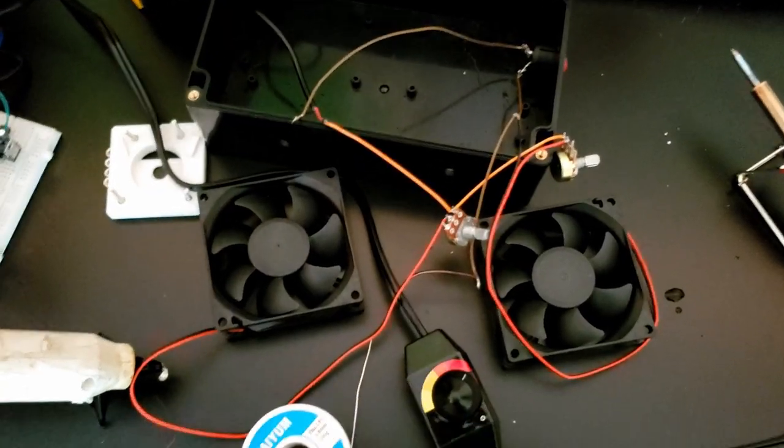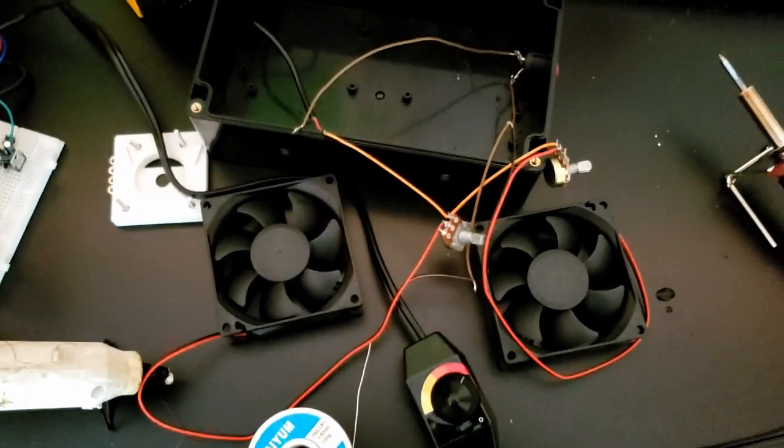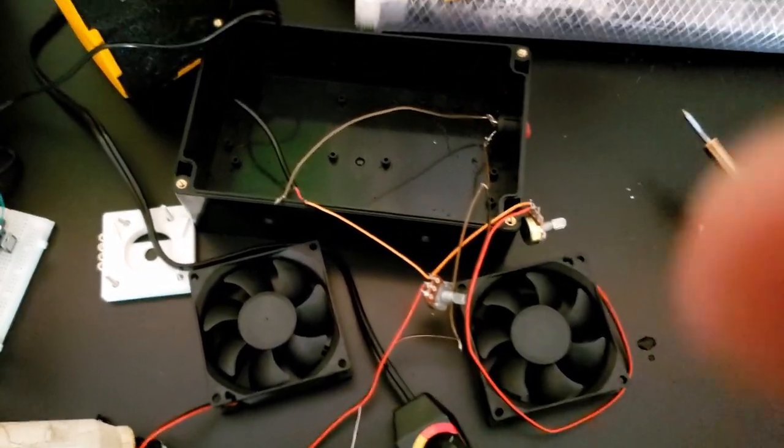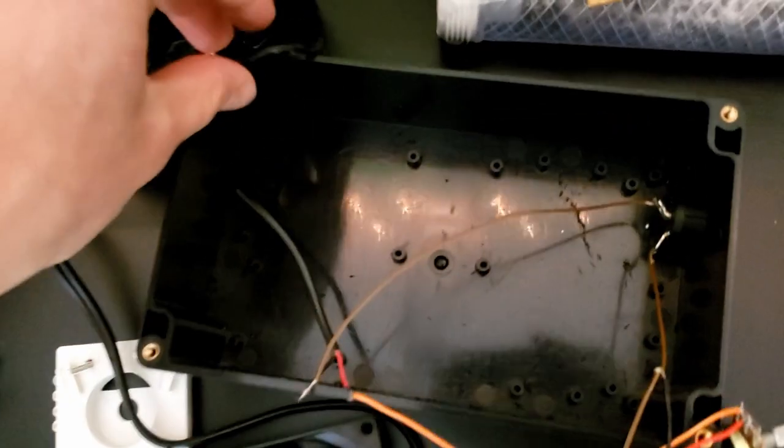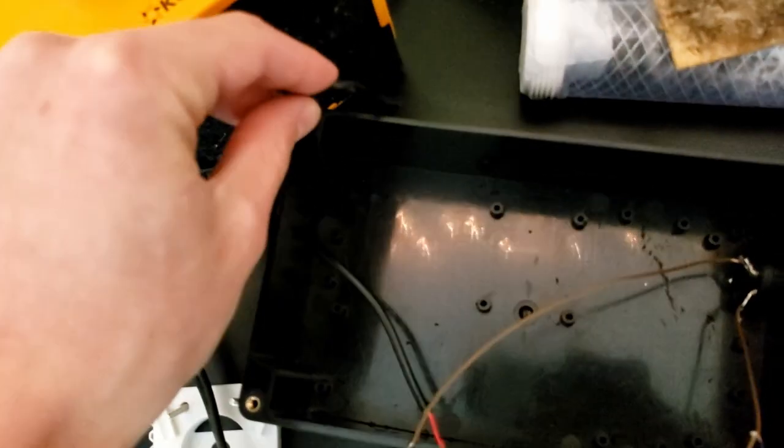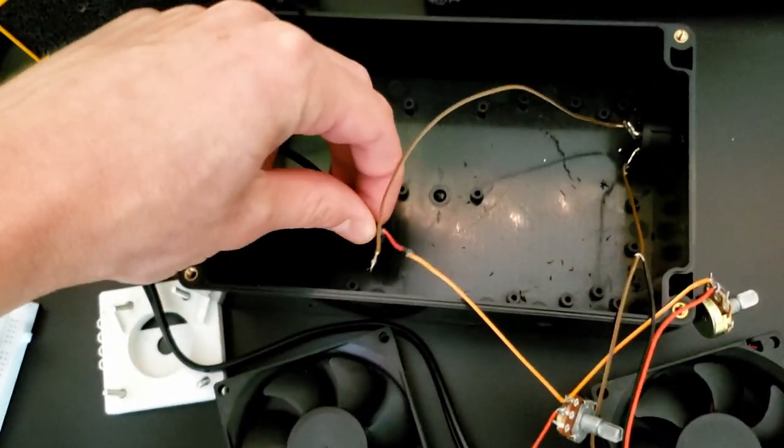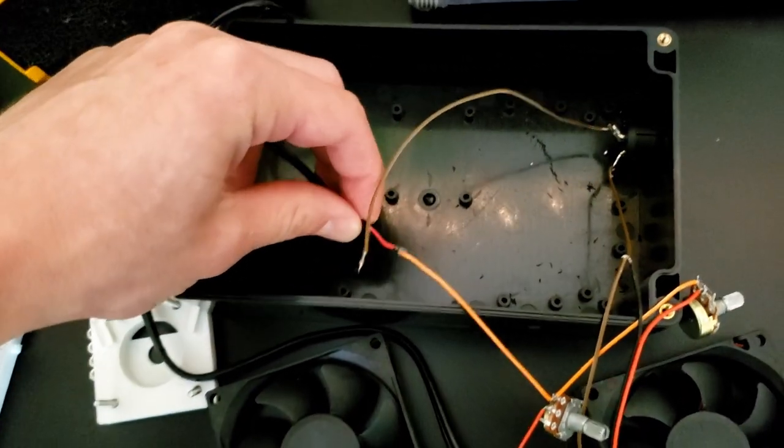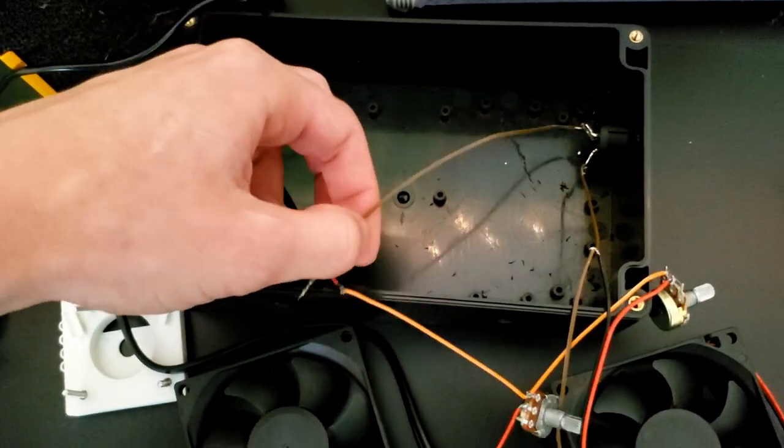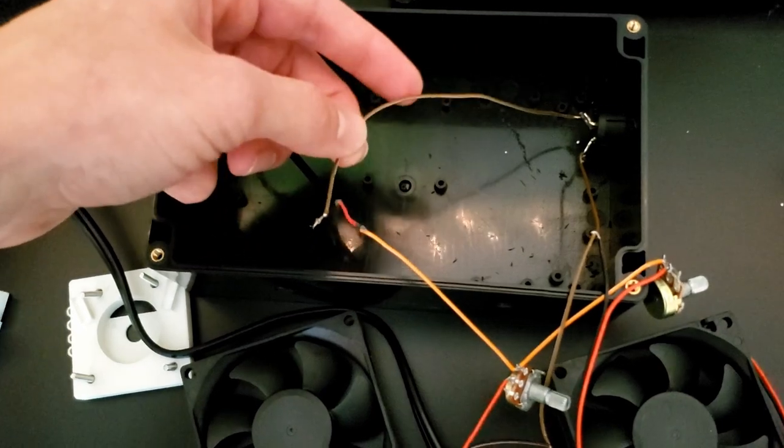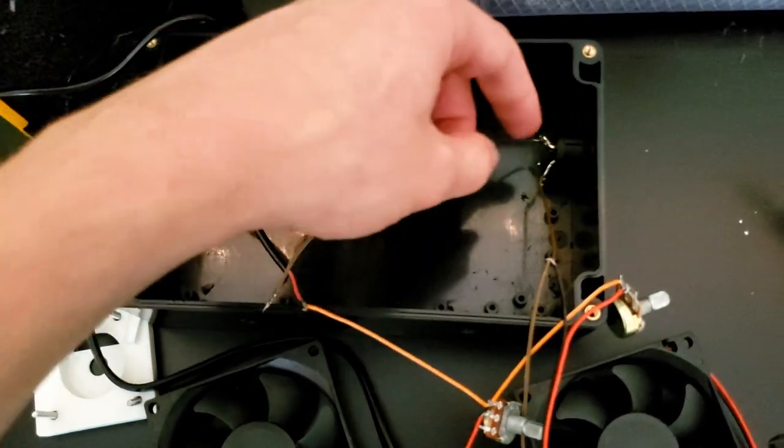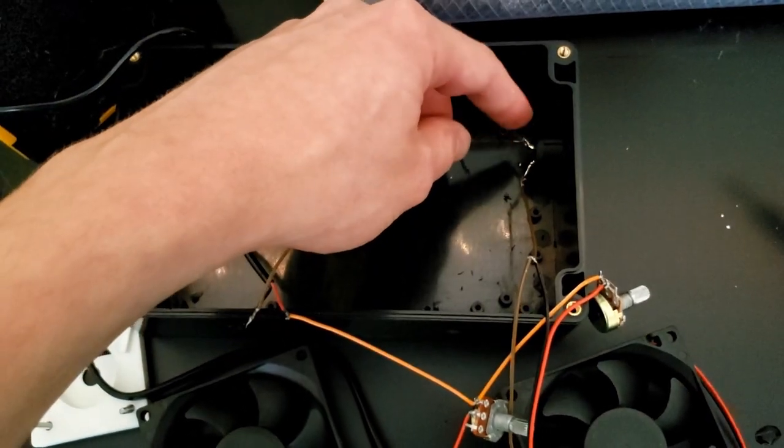Everything's soldered. Look at that. It's an absolute mess. Alright, so again, got the power cord coming in here. Goes right here. I stripped the ends of this. Again, ground is going to the switch.